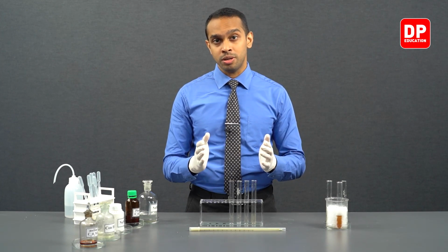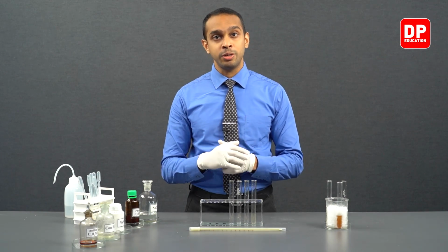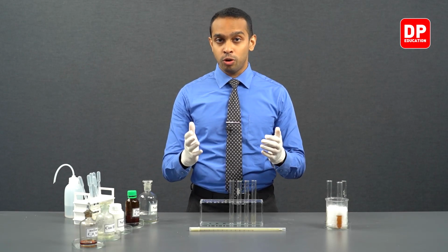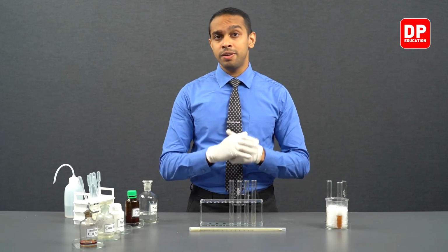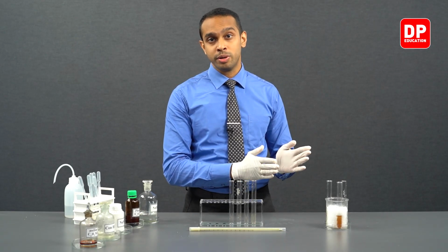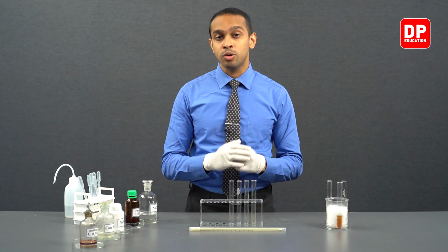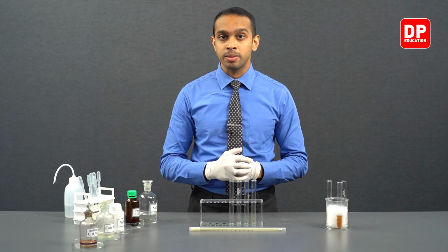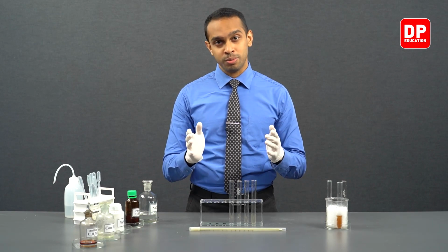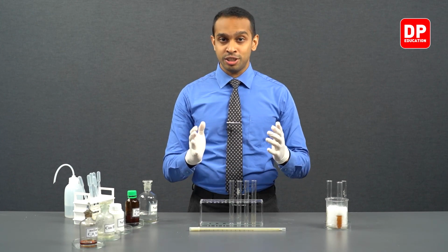So you can figure out if you have done the reaction at a higher temperature, and if we have produced benzene diazonium chloride or if we have produced phenol, by a few observations. If we have produced phenol instead of benzene diazonium chloride, you will see the formation of nitrogen gas bubbles, or your observation would be the formation of gas bubbles. And when we have produced benzene diazonium chloride, the solution that is produced is going to look a pale yellow color.